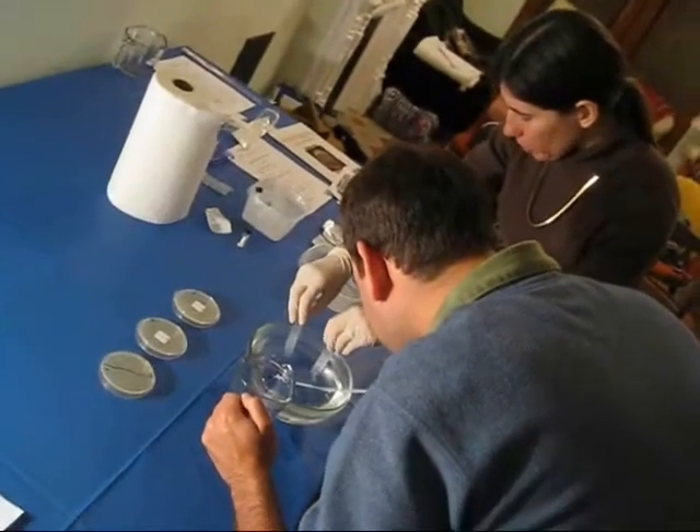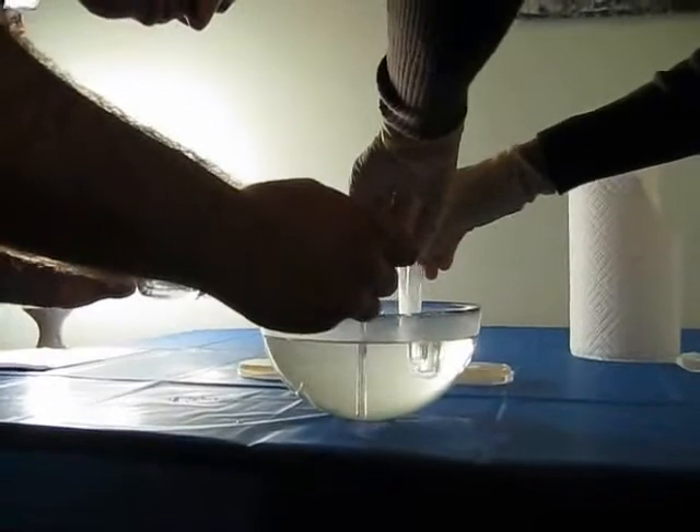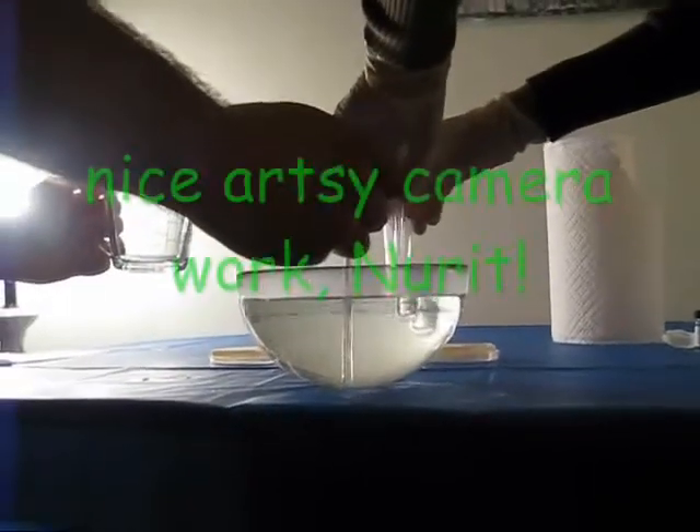Yeah, the hole is a real heat sink — it's not going to change temperature easily. The volume of water is much bigger than the volume of the bacterial solution. Still at 42? Yes we are. Yay!